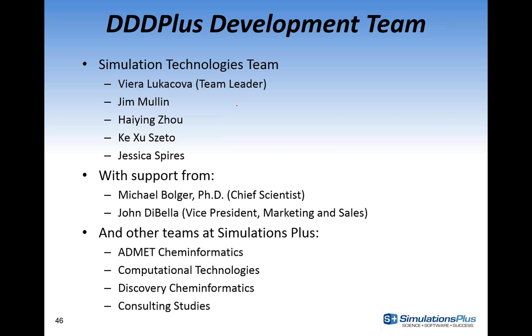This is something that we could be adding in the future to GastroPlus or DDDPlus as a feature. And as more people are using it, and more people are asking for it, it's something we could add to DDDPlus. It isn't currently in the software. The ASD is currently not within DDDPlus.